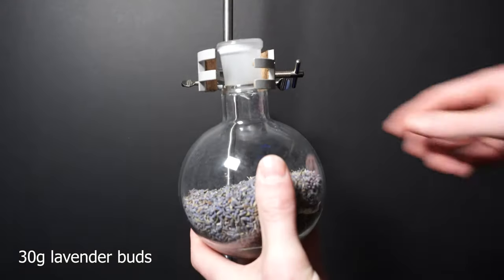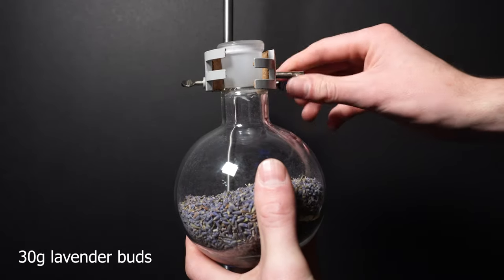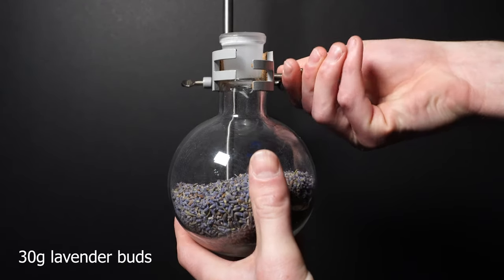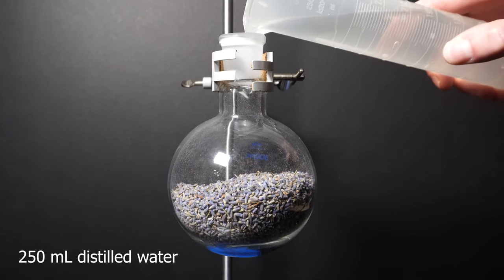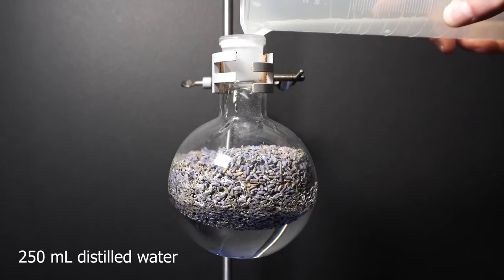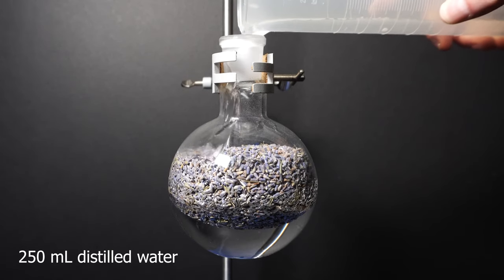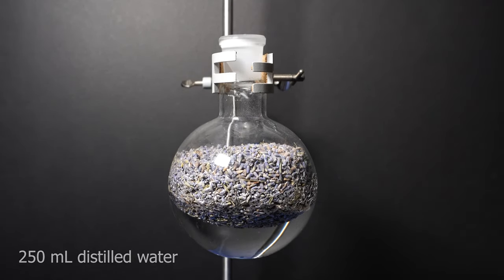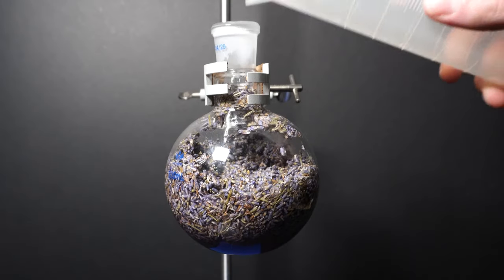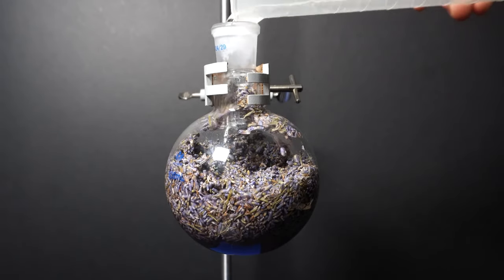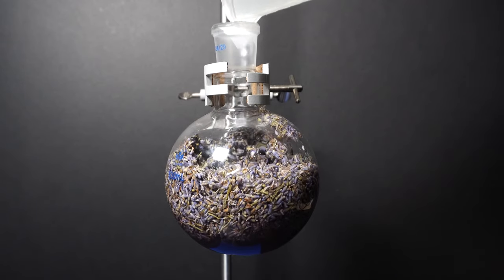We start by adding 30 grams of lavender buds in a round bottom flask. Ideally fresh lavender is used however my lavender has been dry and this causes my yield to be pretty poor. I then add 250 milliliters of water followed by stirring and letting the lavender soak up some of the water. Once most of the water was soaked up I add an additional 50 milliliters of water.